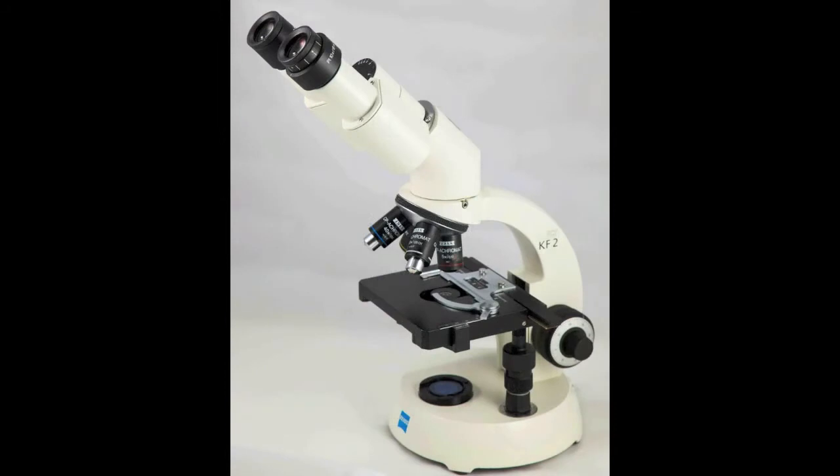Well, there you have it. A brief rundown of the important parts of the microscope, and some basic steps to follow. Now, let's quickly review the procedures in a real demonstration.